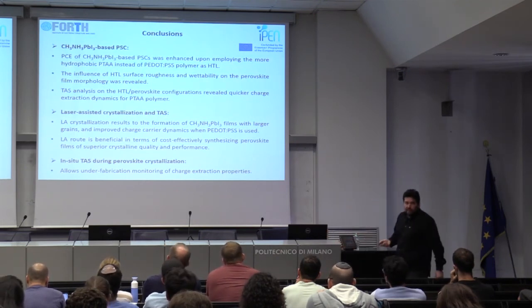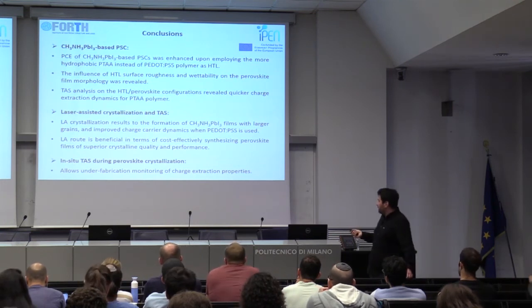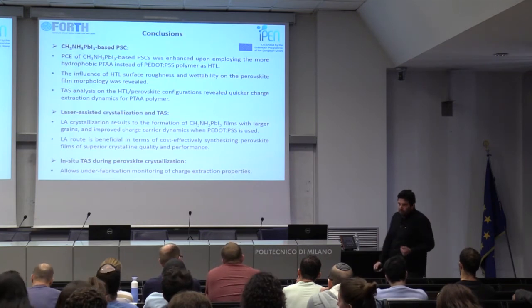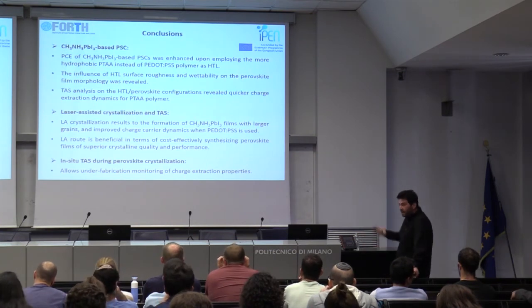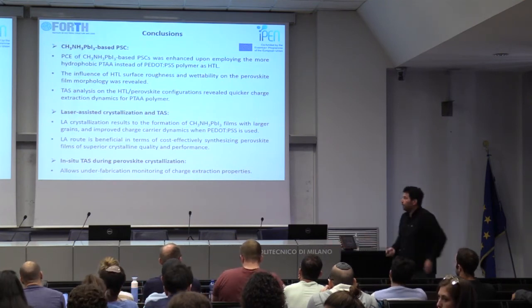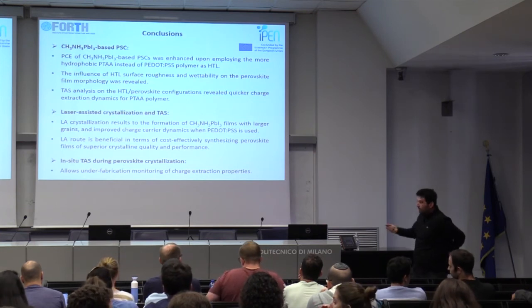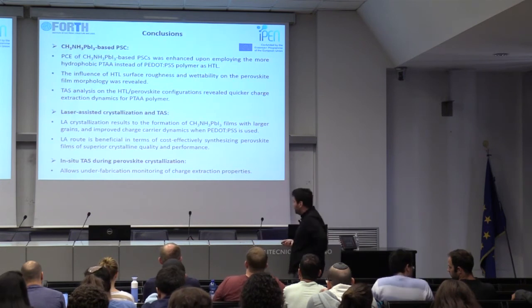When it comes to laser-assisted crystallization, laser-assisted crystallization results in the fabrication of methylammonium lead iodide films with larger grains and improved charge carrier dynamics. And we believe that this is the first step of introducing the laser-assisted protocol as a synthetic procedure for fabricating perovskite for photonic applications.